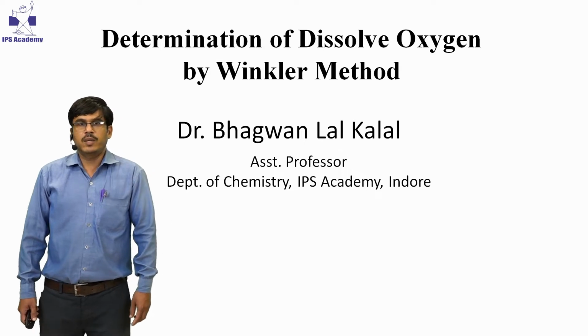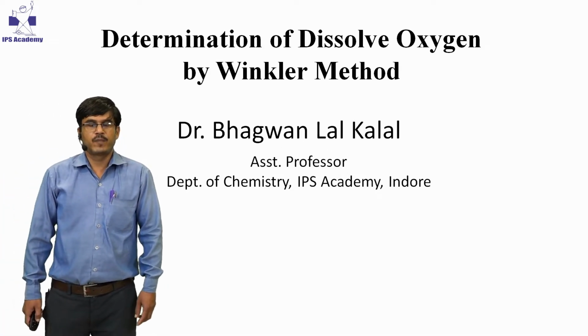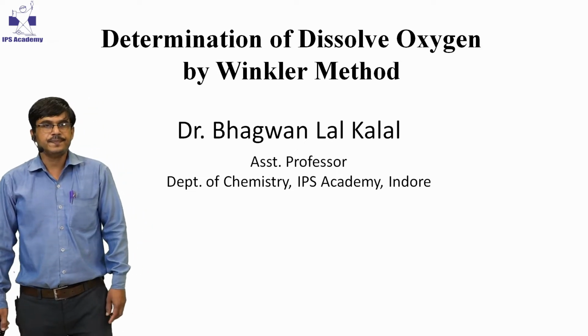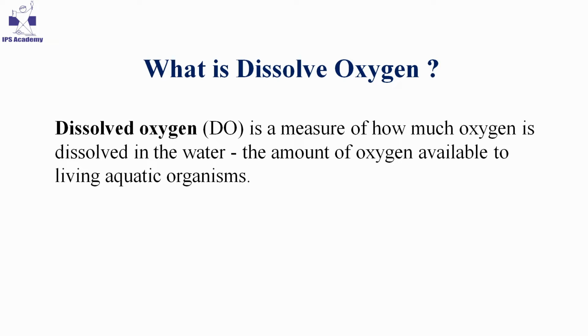Today we are going to determine dissolved oxygen by the Winkler method. So let's start with the introduction. First thing is, what is dissolved oxygen?